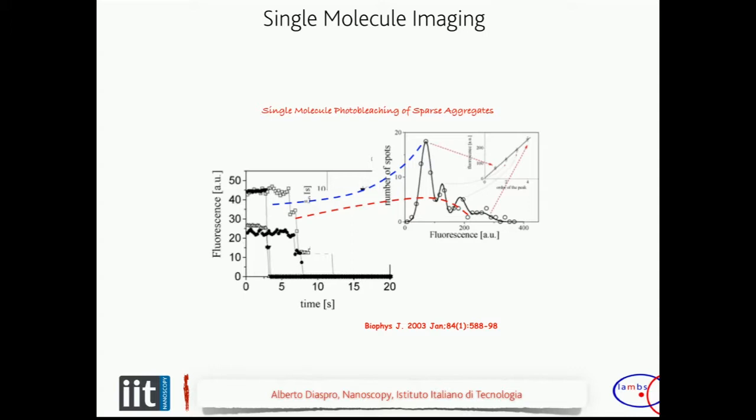And this is a fluorescent property. For those of you that are performing atomic force microscopy and force spectroscopy, probably you do the same. So you pull, and when you have a look at your force spectroscopy curve, you have steps telling you if you have one molecule or more than one molecule. It is the same, because it is always something related to the energy needed or released by the system.